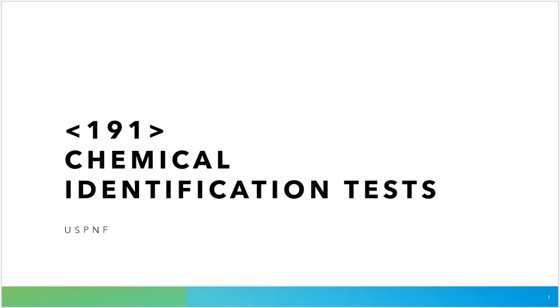Okay, welcome back to our next lecture video that really focuses on the USP-NF. In this, maybe short, maybe not so short, who knows by the time I gab and talk for hours at a time, you know how I am by now. But for at least a bit, we're going to formally talk about 191, which is the chemical identification test that's found within the USP-NF.